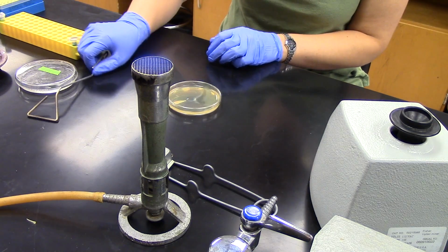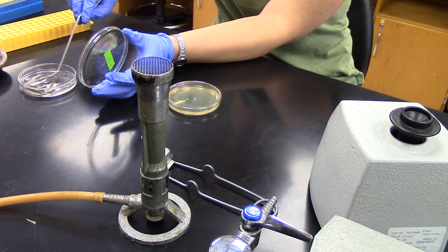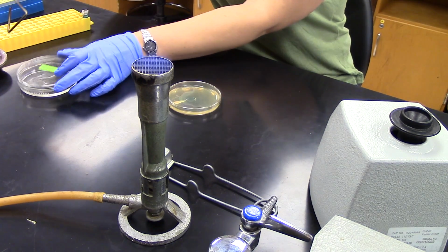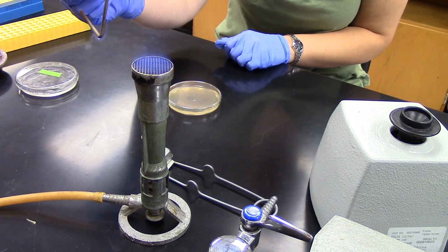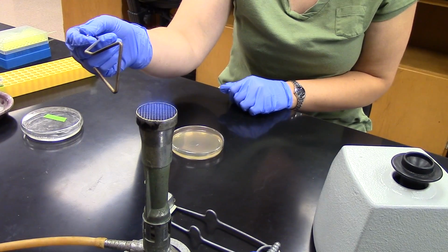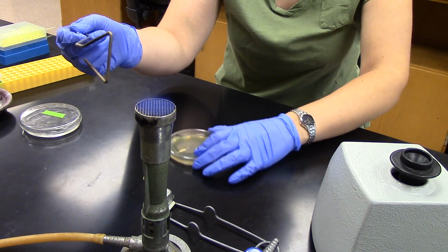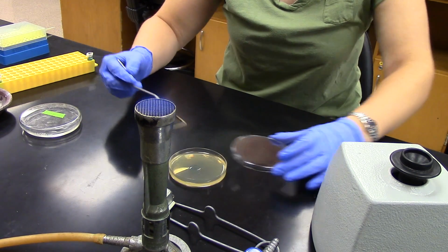Okay, now you're ready to spread. So you first want to sterilize your spreader. So you dip it in the alcohol, keeping the alcohol far from the flame. You just run it through the flame. Don't keep it in the flame. You don't want to superheat it. That would be bad. Wait a few seconds so it gets to cool down, and then you plate.